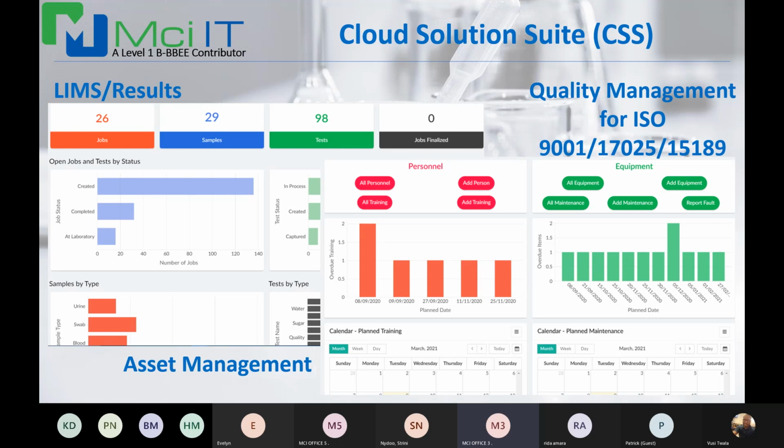A typical example of that would be a laboratory that can have a $3 million, maybe not $3 million, but let's say a $300,000 analyzer machine. It's a financial asset that requires calibrations, services, technical management, and so forth. Compare that to a volumetric flask, which is a consumable, but in terms of a laboratory, it requires the same level of technical management that your $300,000 asset would require. And most systems fall short of providing the same functionality on both items, and that is a major advantage of our asset management module as well.